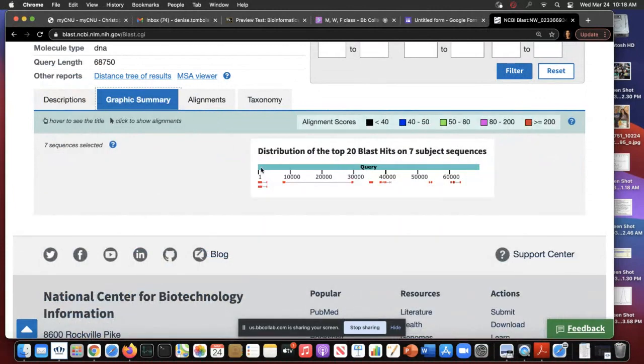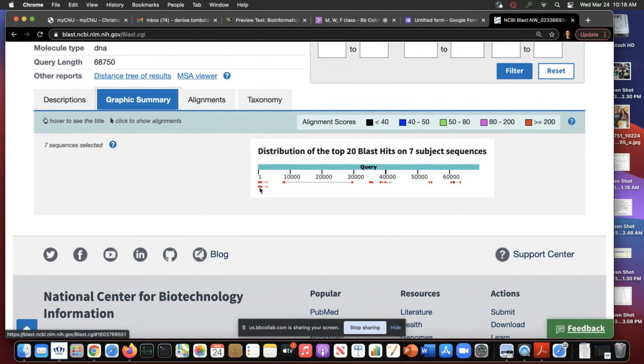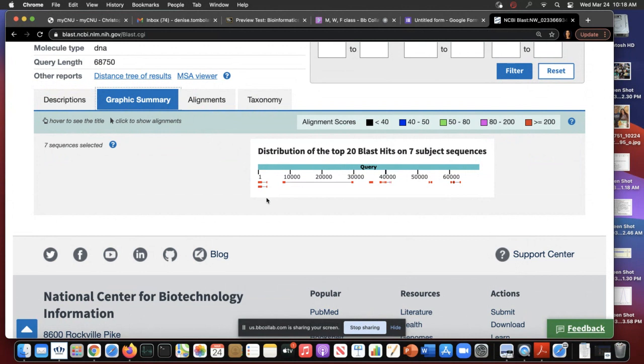Here's my genomic sequence or that sequence I entered that I didn't know are there genes or not. And then wherever there are the red boxes that correspond to that area, that's where the genes are. There would be one gene predicted here, and there are two versions for that gene. We're going to learn about alternative splicing also.